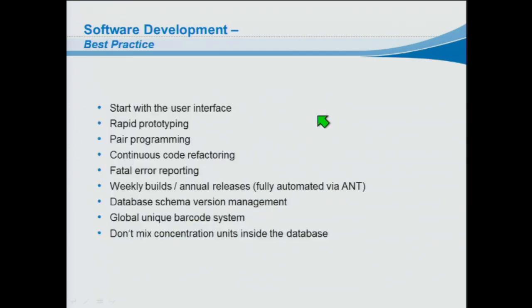And some experiences we made during development. When I started in the company, I really had no clue what we were doing, but I was learning and learning. I started with a user interface, and I got feedback from the lab and from the users: this is bad. And then I said, okay, I will correct this. We had a lot of innovation cycles, and so the people in the lab learned from the software developers and vice versa. So rapid prototyping was really the approach to choose. And we also did continuous code refactoring.